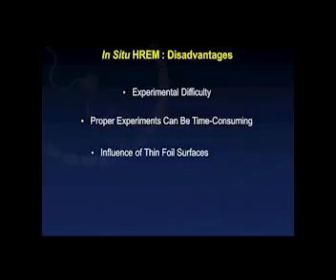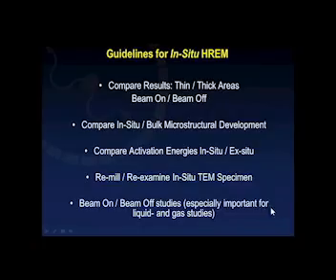And whenever people talk about TEM studies, there's always questions about the influence of thin foil surfaces. But in this era of nanomaterials, where everyone is trying to look at nanoparticles, nanowires, etc., the large surface area to volume ratio associated with these nanomaterials is in fact of interest to the community.